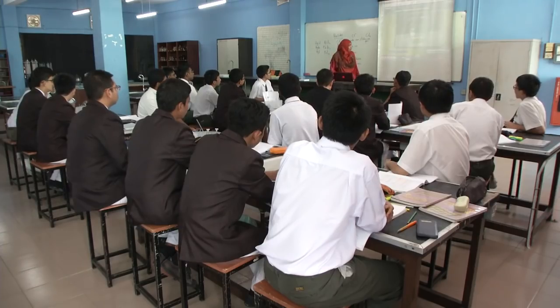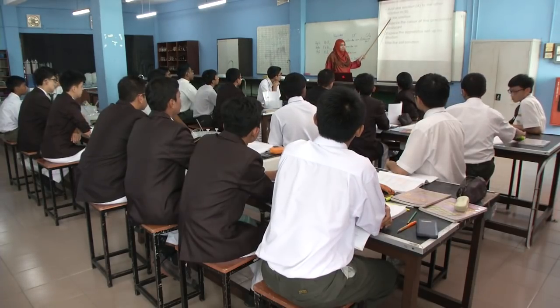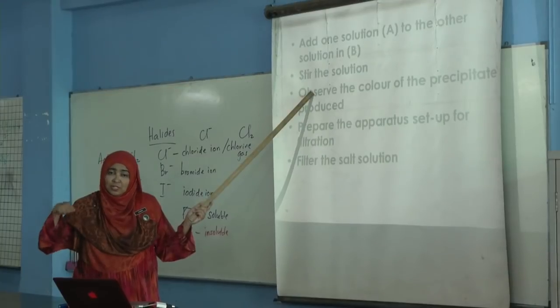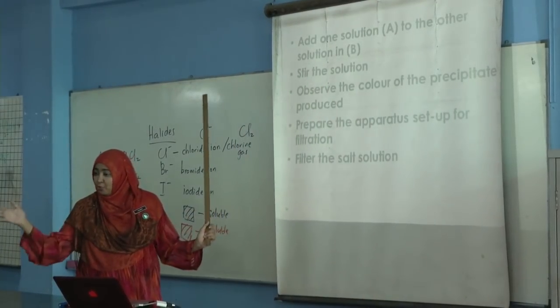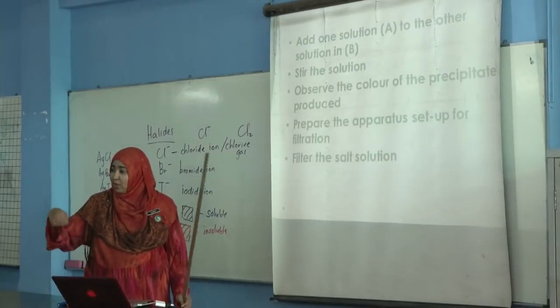So now what you're going to do is, in your basin, you have two different solutions. Okay? Now, you just add the two solutions together in a beaker. And then stir. How long do you stir? Not to say dissolve. It's an insoluble salt. It's not supposed to dissolve. It's supposed to mix well. Okay, so stir about 1 minute.